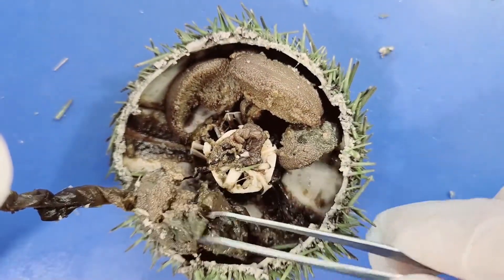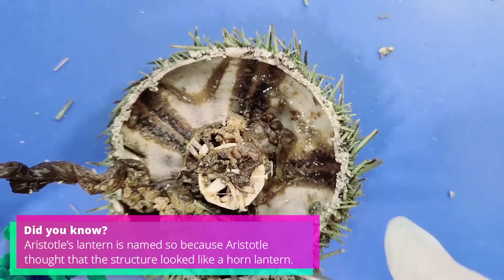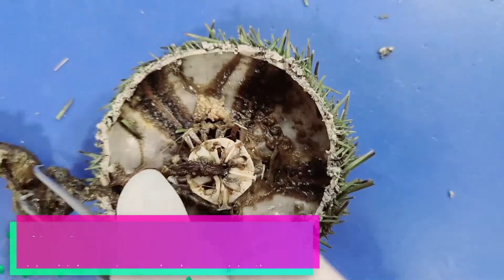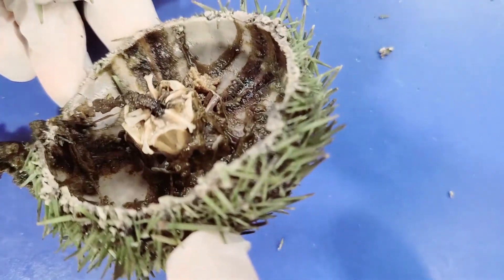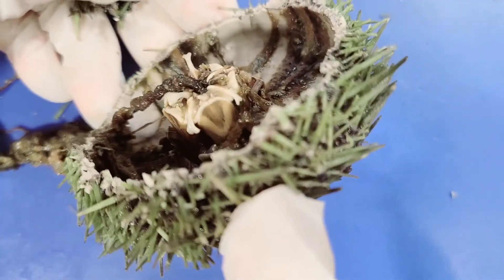Now I'll remove the gonads to get a better look at Aristotle's lantern. If I lift it up, you can really see how fascinating and unusual this structure is.